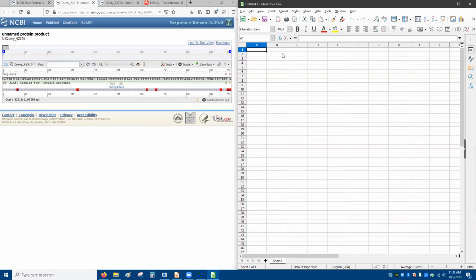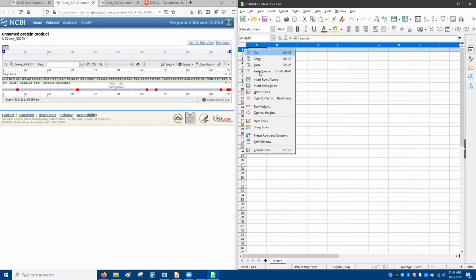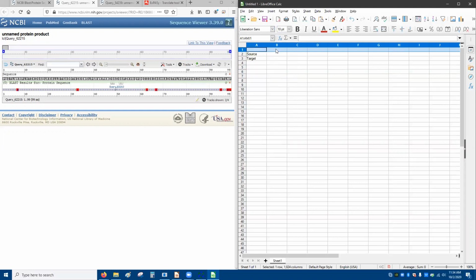So we have source, we have target. We're going to have position.